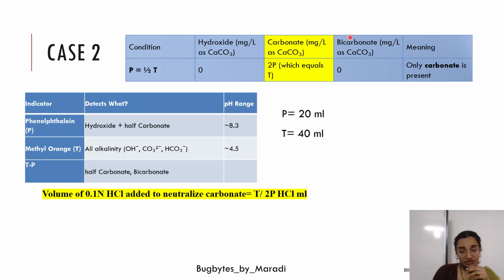Okay. So, sorry, there is no bicarbonate, meaning only carbonate is present. So, how can we say 2P over here? Okay. So, what is this 2P? If you remember, we'll just take a basic example.